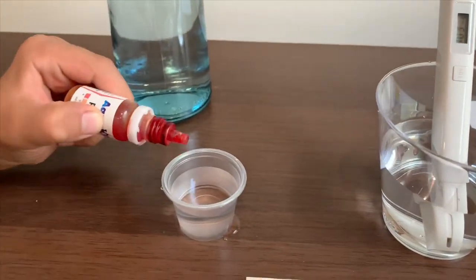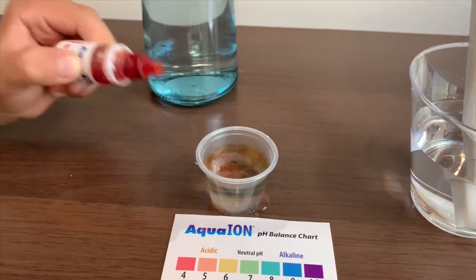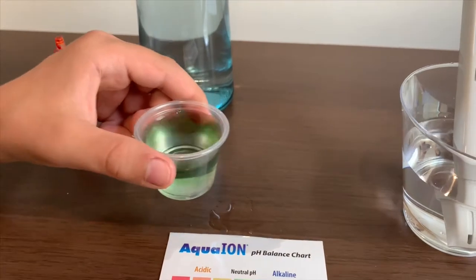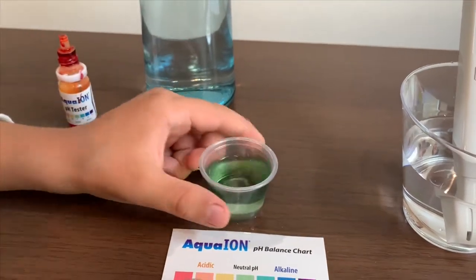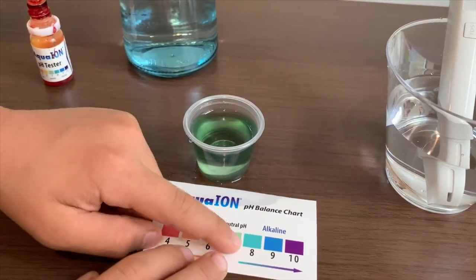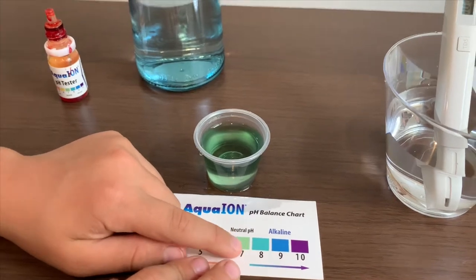Now let's test the pH. We're going to do two drops. This is around seven or more, so that means it is neutral pH.